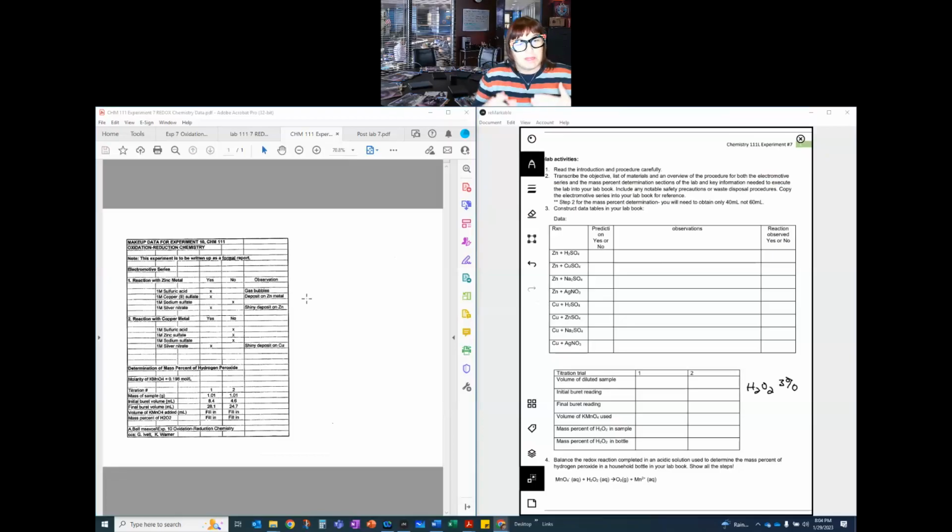This is kind of like having me in the lab to go, is that what I think it is? Yeah. Okay. So this is what you can see. But this way you're able to do your own type of experiments. All right. So those are observations. Did you observe a reaction based on the observations that you had? Okay. This titration data is down here. The KMnO4 is listed because you'll need that to do your calculations. And then all the volumes that you need are here to get the best sample initial KMnO4.